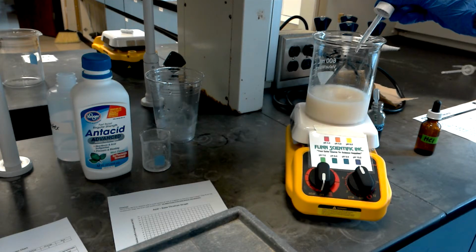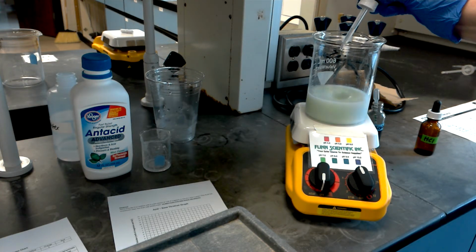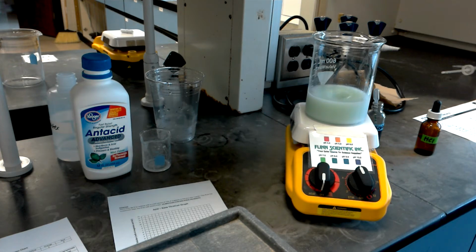Now, even though we're pouring this down the drain, we don't want to just dump it down the drain. We want to add a copious amount of water. We always want to flush any chemicals that we're using in the lab, if they're appropriate to be flushed down the toilet or down the drain. You want to make sure that you use excess water. So we're almost to the pre-drain color, so they'll make it safe. All right, that looks pretty good.